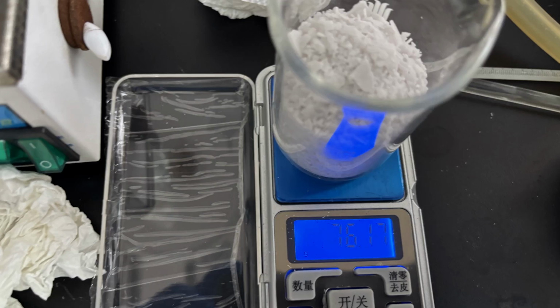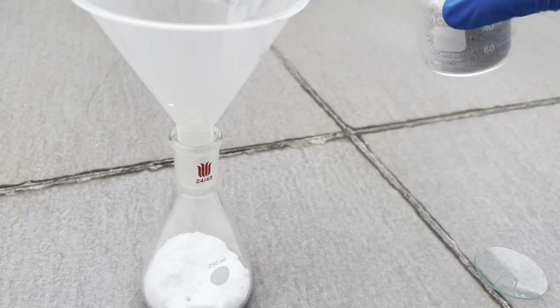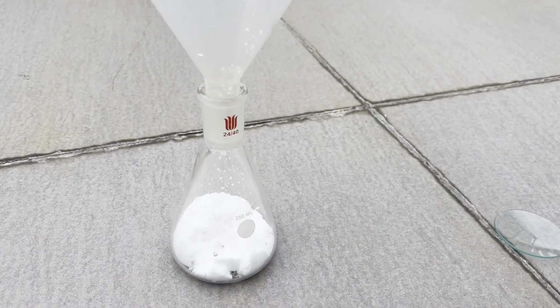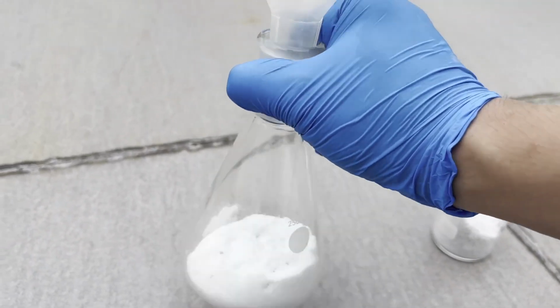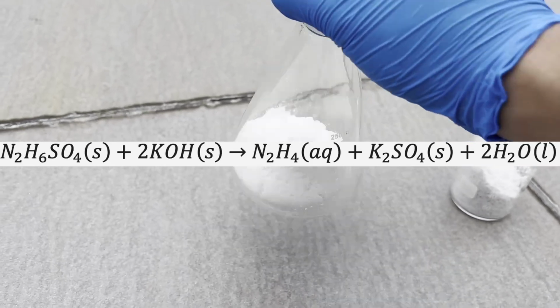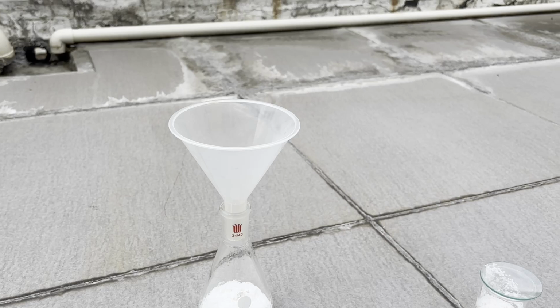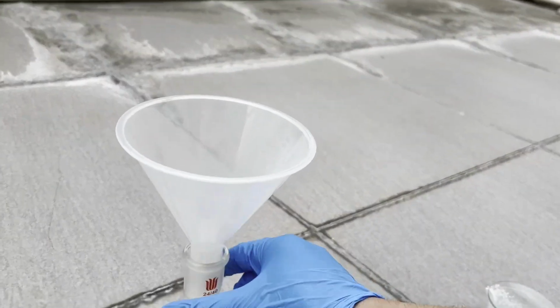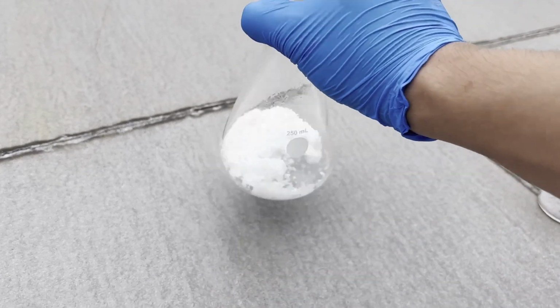76 grams of 85% potassium hydroxide is weighed and also powdered, this time being much more annoying due to its hygroscopic nature. The hydrazine sulfate is added to a conical flask and brought outside to prevent me being killed by hydrazine vapor. The not so finely powdered potassium hydroxide is added to it in small portions. Simply shaking the flask will allow the two chemicals to react and produce hydrazine in addition to potassium sulfate and water. Nothing seems to happen yet, but as more potassium hydroxide is added, visible liquids consisting of hydrazine and water begin to form, and the mixture clumps together.